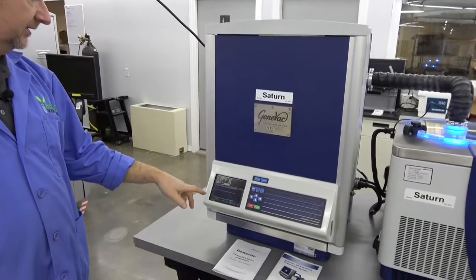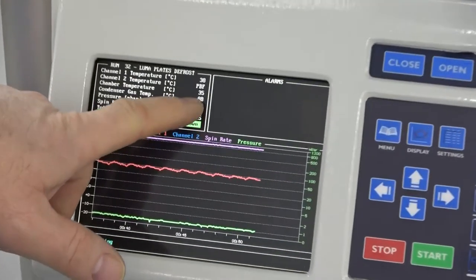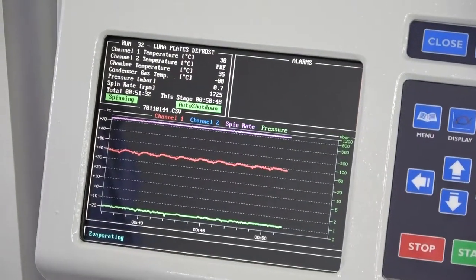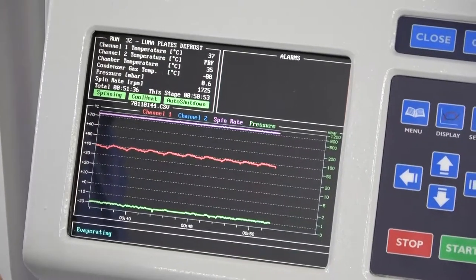If you look at the screenshot, you can see on the condenser on these particular models with the newer upgrade condensers, this thing's getting down to negative 88 degrees Celsius. You're going to be able to evaporate any kind of solvents out there with those type of temperatures.